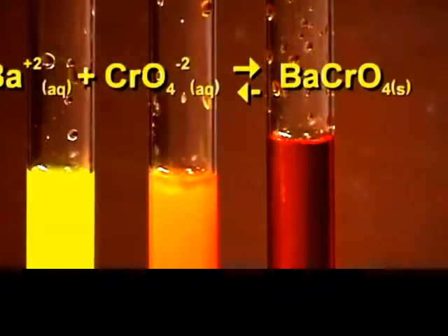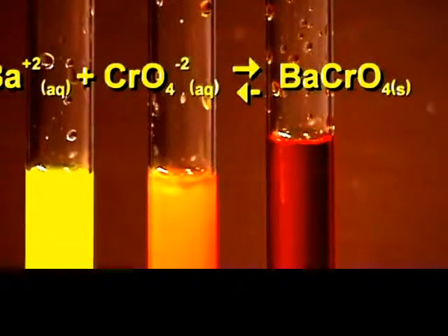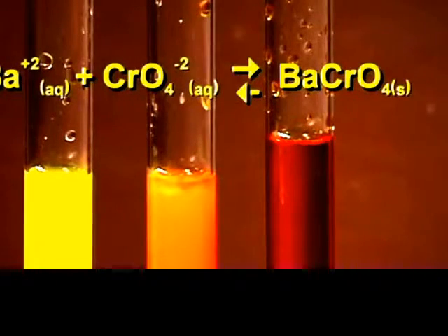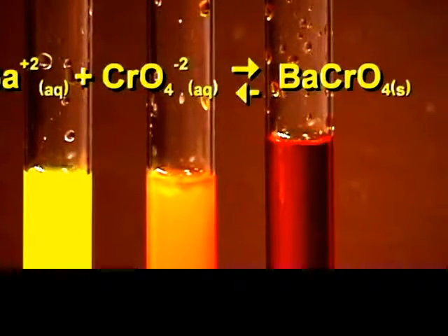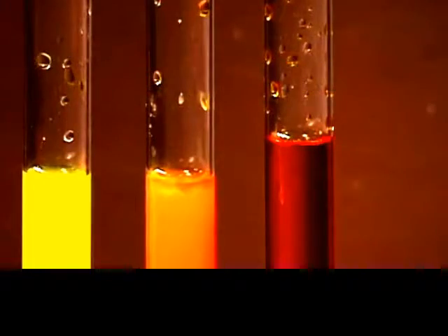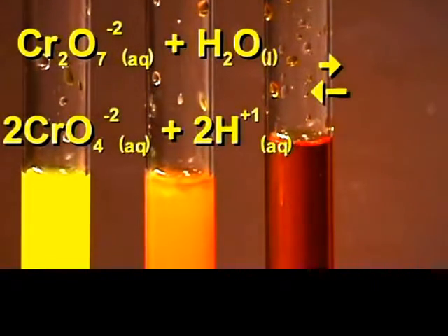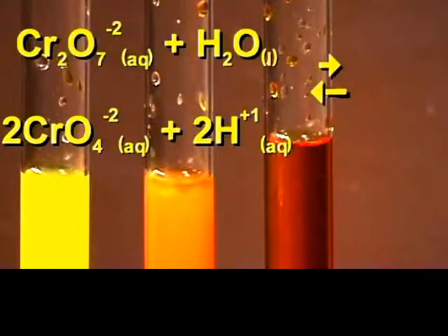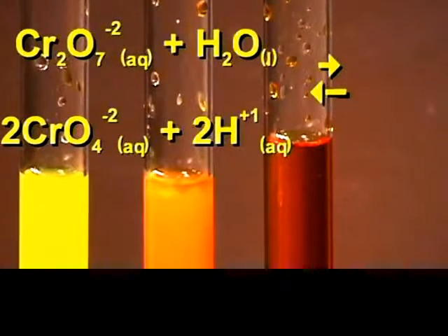In the first tube, there is a high concentration of chromate ion, so we get a large amount of precipitate. In the second tube, we only get a small amount of precipitate. This indicates that the equilibrium lies very far towards the dichromate side, and only a small amount towards the chromate side.